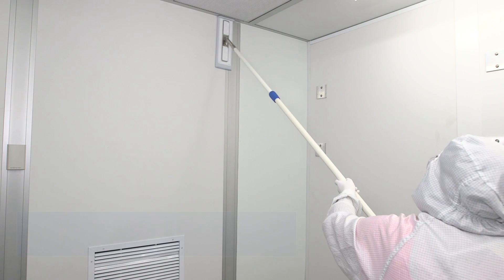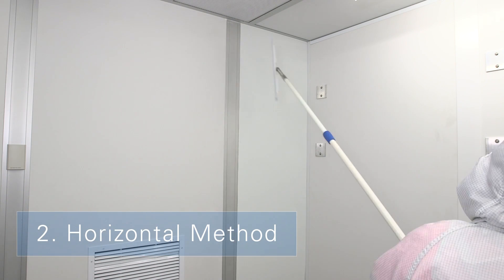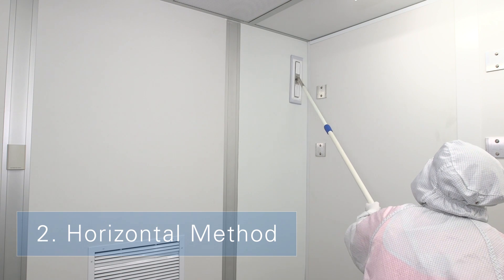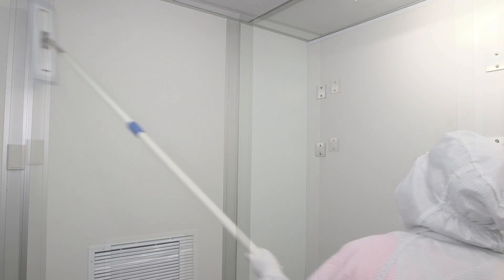For the horizontal method, start at the corner of the room furthest from the entryway, moving the damp mop from the topmost corner across the wall, covering an area you can reach from a standing position. Use overlapping, unidirectional horizontal strokes, wetting the mop head about every two meters.